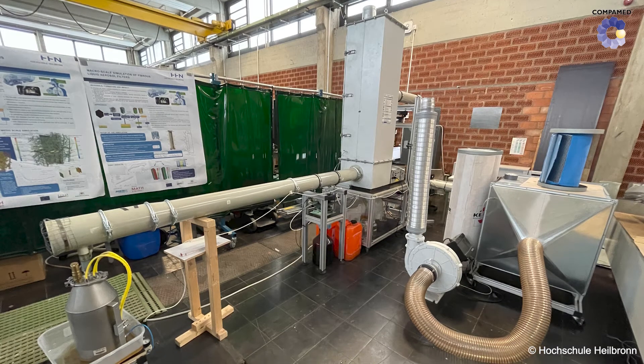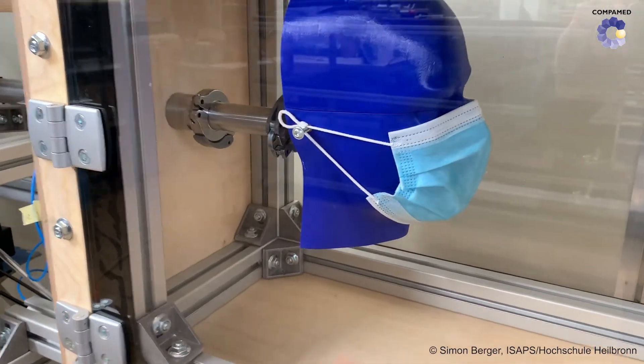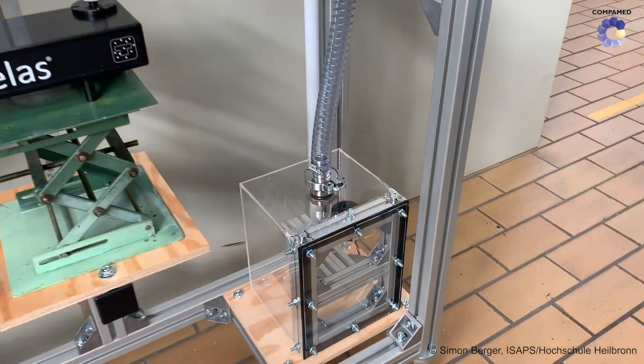Even though fluid mechanics engineers have already built several rigs for aerosols, industry, and testing, this rig poses special challenges. Once you have a predefined size, the whole thing has to fit into the sterile bench. It's also important that no lines or hoses have to be routed from the sterile bench to the outside. This is a challenge, especially with aerosol generation, because compressed air is needed. This means we actually have to generate the compressed air ourselves with a compressor in the sterile bench, thus avoiding potentially transporting contamination from the inside to the outside.